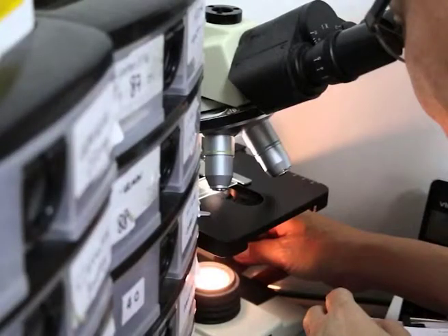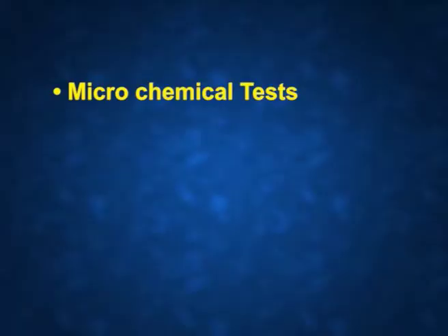After the preliminary examination of paint evidence, we will now be studying the confirmatory examination. The confirmatory examination comprises certain chemical and analytical techniques.